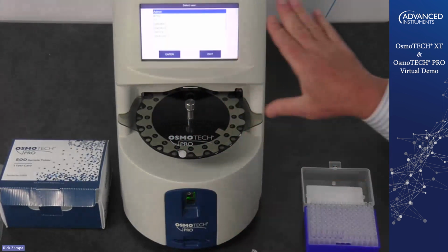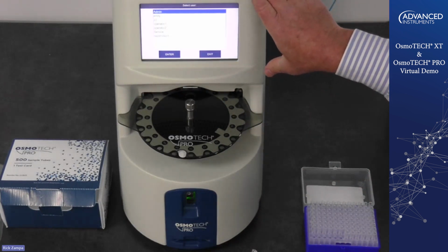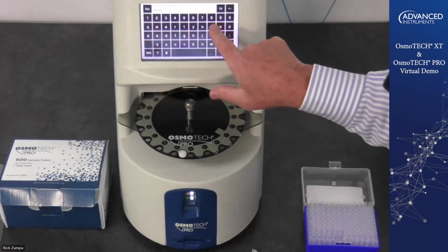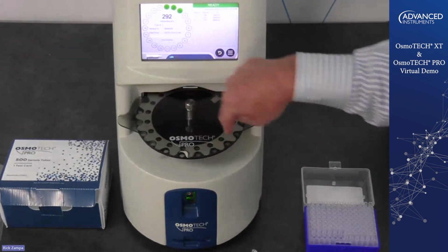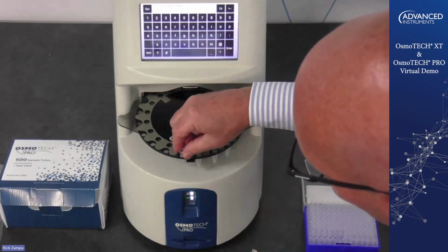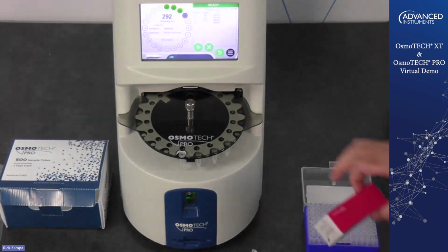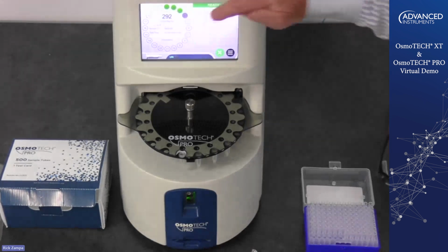So you see this one, as I mentioned earlier, I didn't have the user ID and sample ID required on the other instrument. It is required on this one. So I'm going to enter in my user ID. Hit enter. Now the turntable is going to move around. It's going to ask me for my sample ID. I'm going to load my sample. I'm going to grab my box. I'm going to scan my barcode, and you can see it's loaded that in there. And I'm going to hit start.